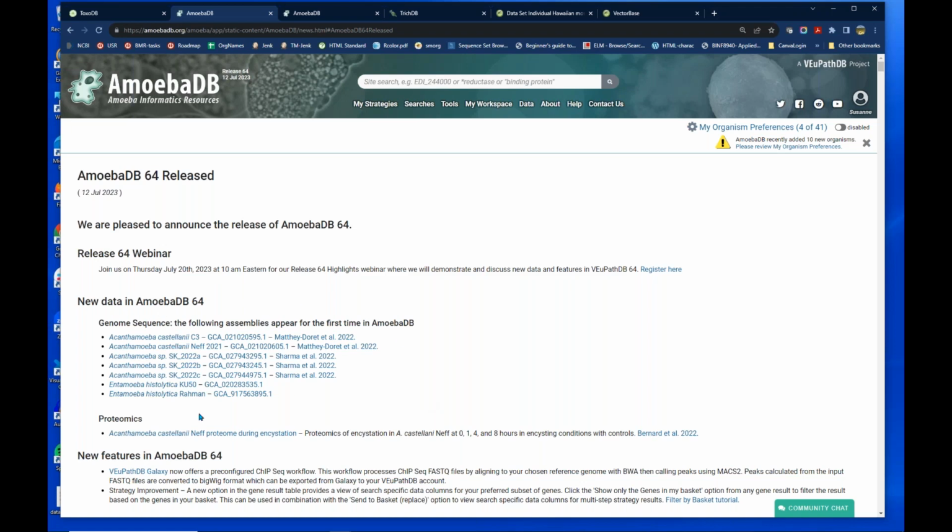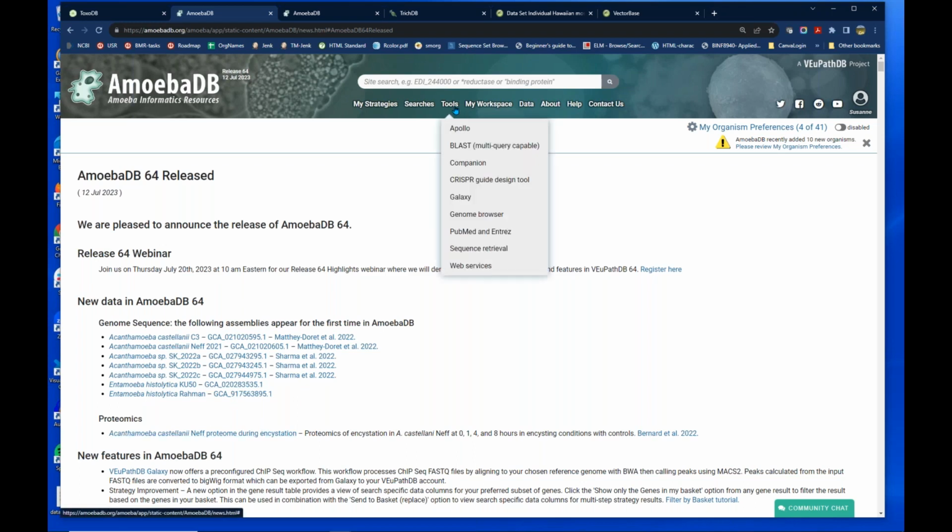But we've requested that, and when that annotation appears in the repository, we'll be able to load it. But we still can take advantage of these genome sequences, right? These assemblies. And one of the major things that you can do with those is to BLAST against that.